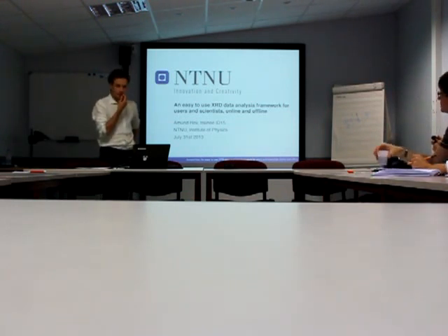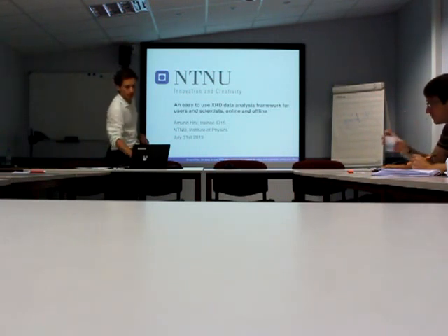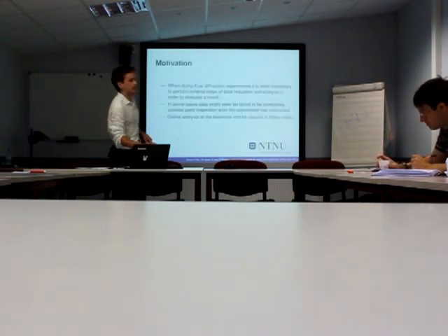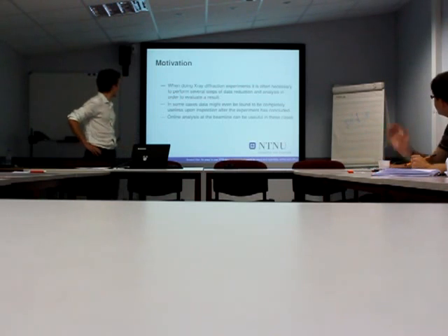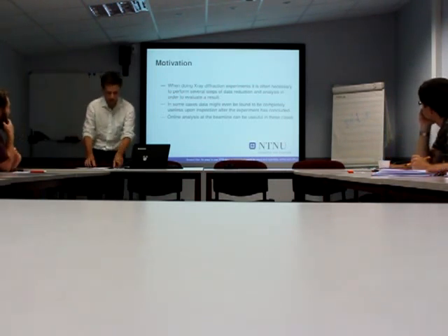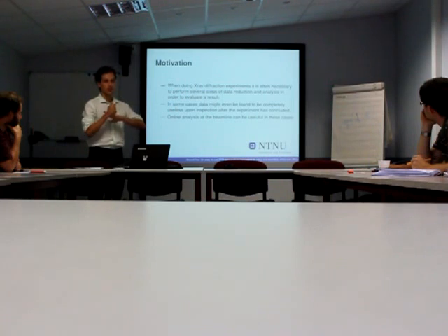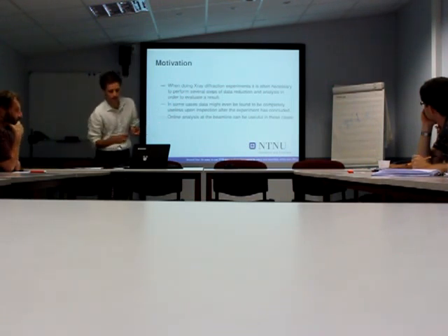So when I came here last summer, Bayo had something he wanted to tell me. When you're doing an X-ray experiment, it's often necessary to do a lot of data processing and data reduction on your experimental data before you can find a result that you can evaluate.